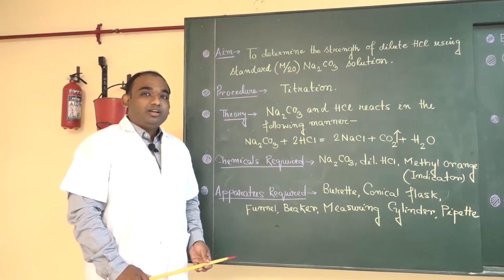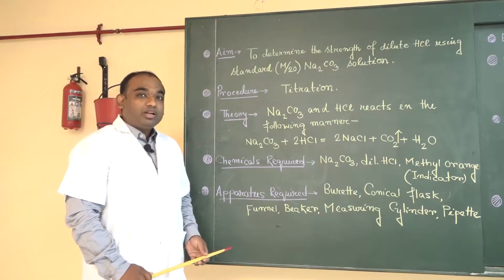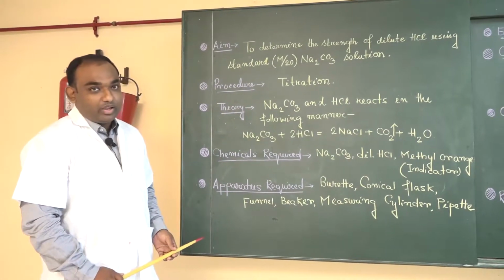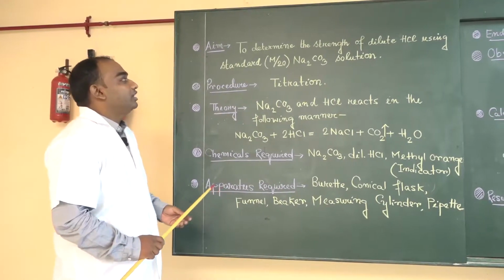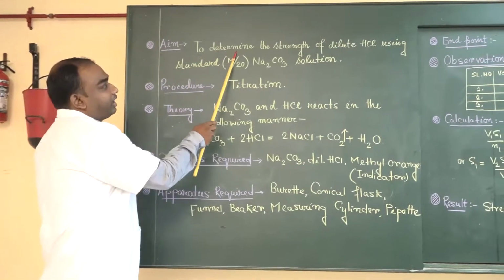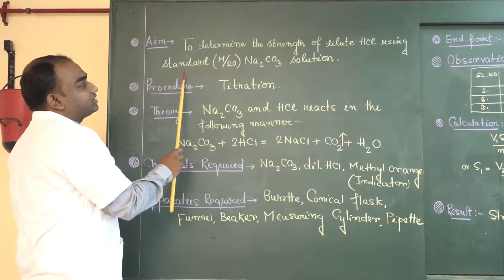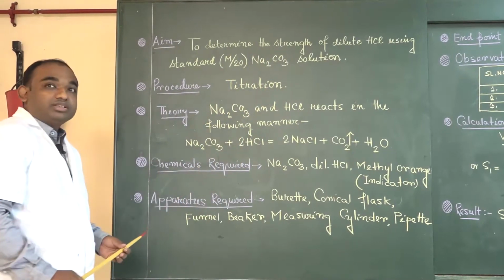Okay. Our term 1 exam is knocking at the door. So from your term 1 syllabus, now we will focus on the practicals. In the first practical that we are going to perform, that is to determine the strength of dilute HCl using standard M/20 sodium carbonate solution.